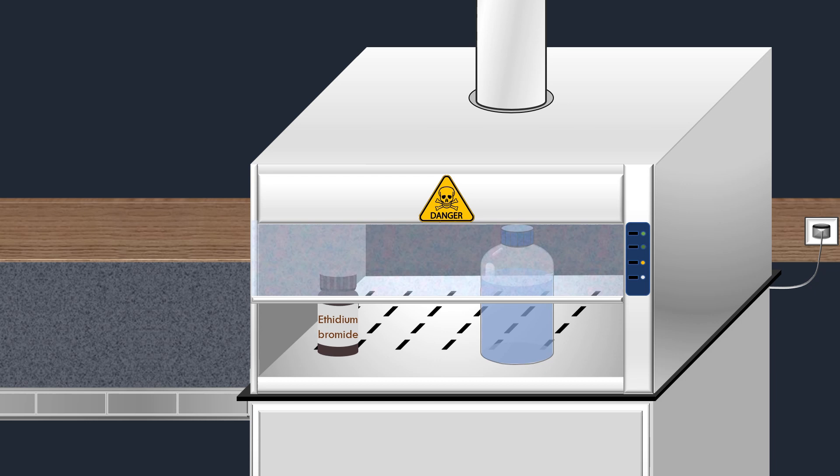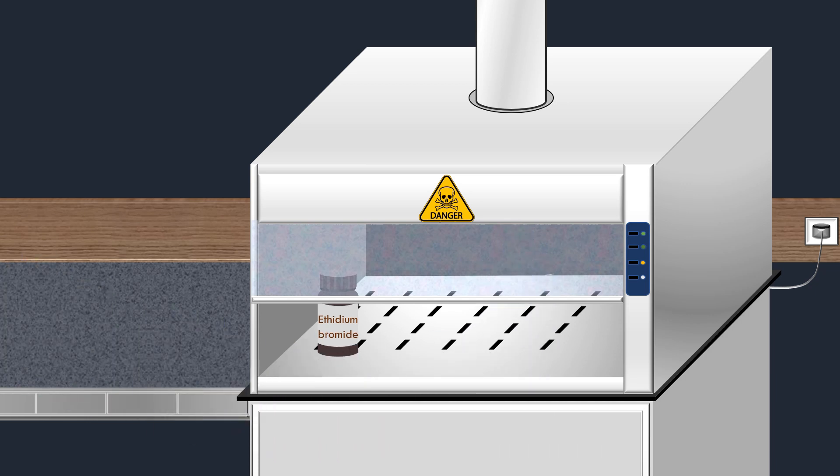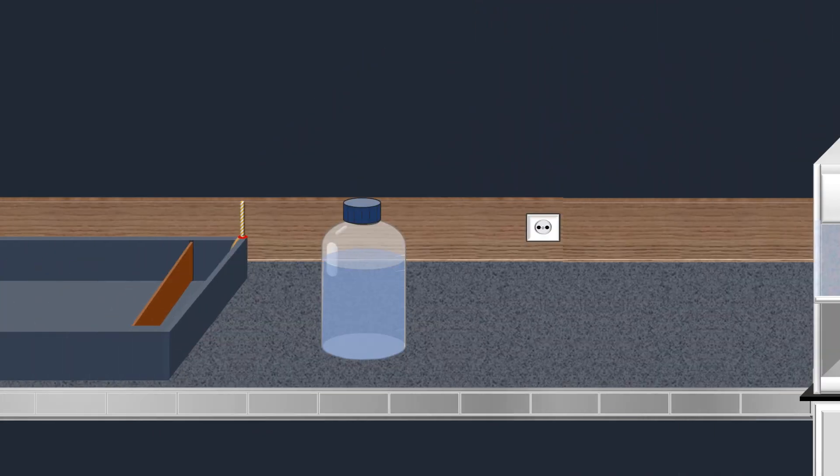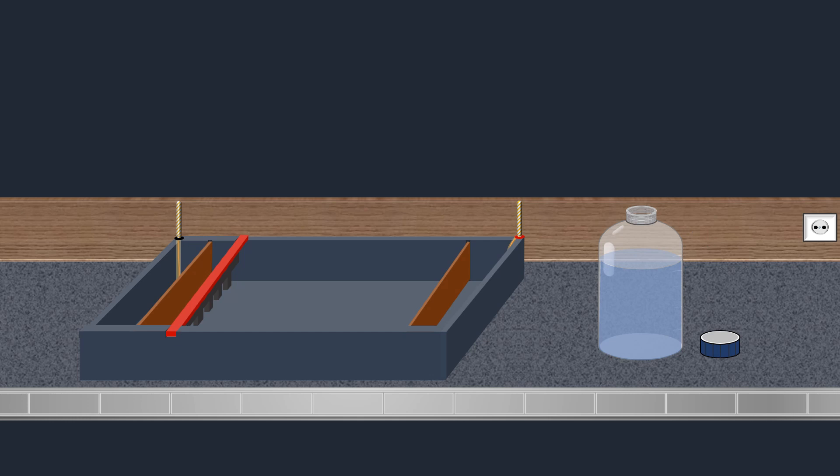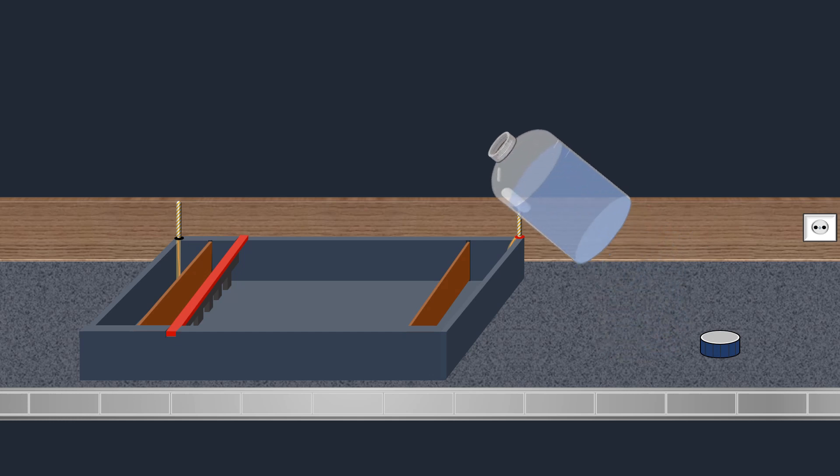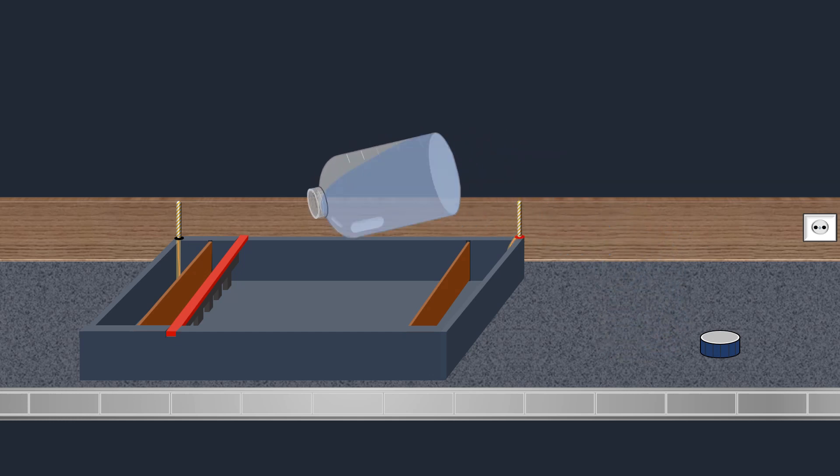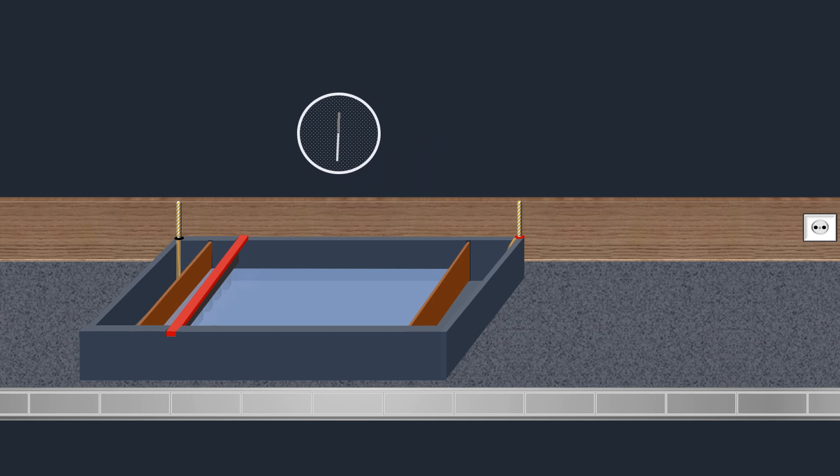After addition of ethidium bromide, the agarose solution is poured into the electrophoresis tank. Then the gel is allowed to solidify at room temperature.